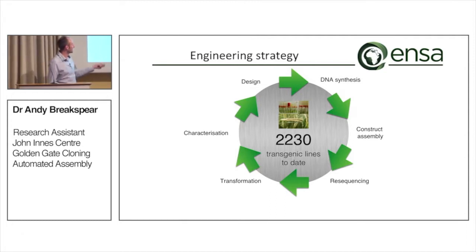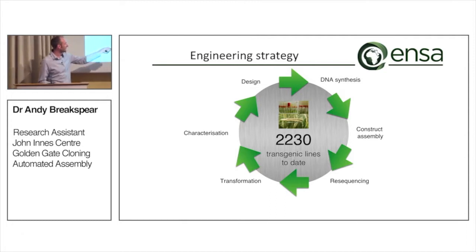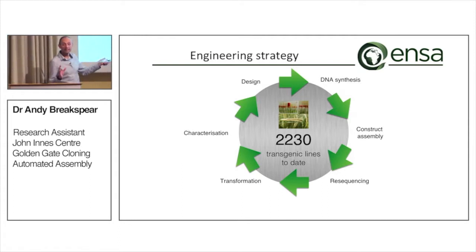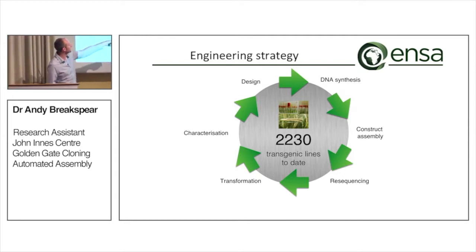You know, for a little bit of organization now, it's well worth that. So transformation, but then the exciting bit that most scientists enjoy is actually looking at those transformed plants. Are the plants doing what we hoped they would? If they are, then that's great. If not, we need to look at the design and think about what we're going to do next. So that was the general cycle that we thought we'd agree on.